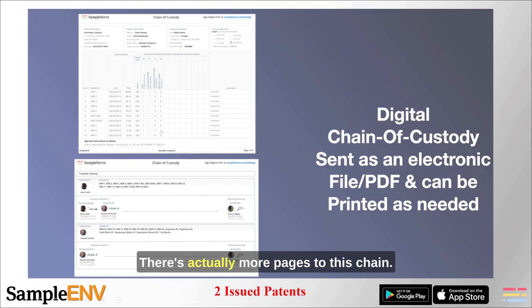There's actually more pages to this chain. I just only used a couple of them. And down here are the samples that I collected, and then I took mine to the lab myself. So what happened is we were both out there sampling. I decided I'm going to be the one taking them to the lab. Jake gave the samples to me, and I took them all to the lab.